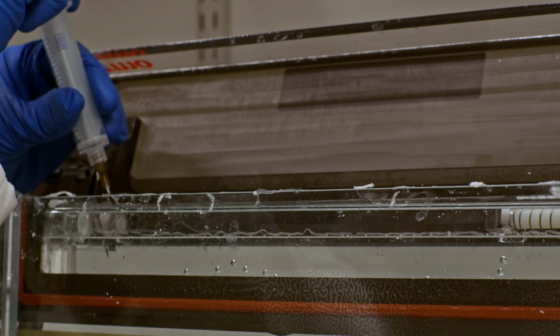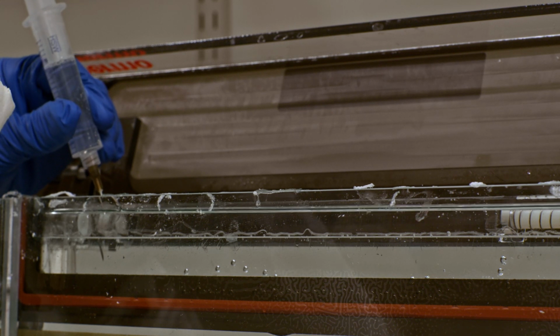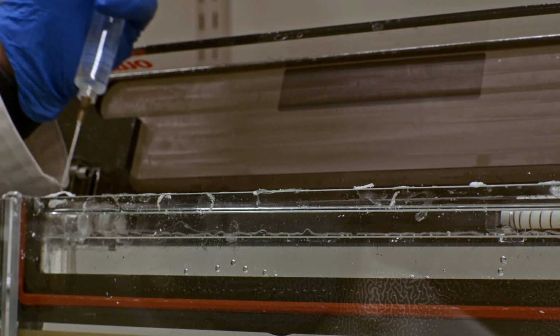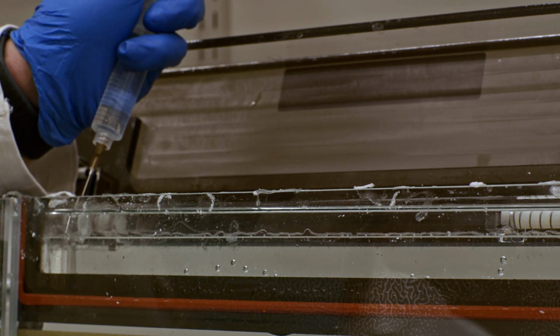To wash the wells, I use the TBE that's already inside the first compartment of the gel box. And then I see the wells and then blast a little bit in there to effectively wash the wells. Do this about 2 times just to make sure that all the wells are nice and clean.